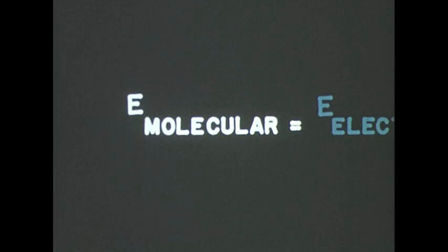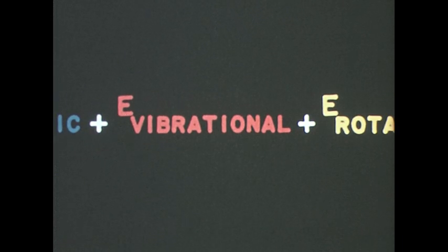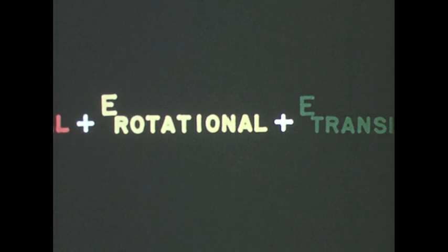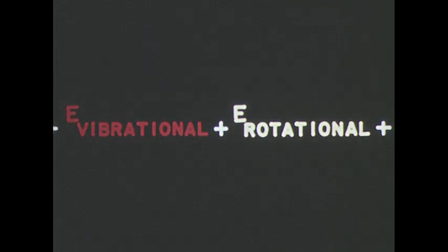Thus, the total molecular energy equals E electronic plus E vibrational plus E rotational plus E translational. Since measurements in the infrared region allow us to evaluate the energy of vibration and rotation, we shall consider only the vibrational and rotational terms.